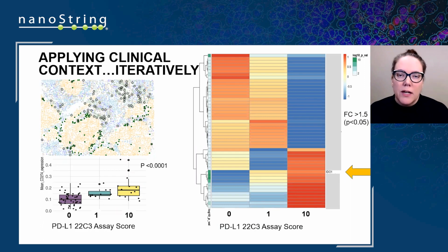We're looking at PD-L1 expressing macrophages by spatial context or niche. We're comparing them to each other to determine whether that spatial location is actually critical clinically or not. We elevate that to the next question, which is, we know PD-L1 can also be expressed in dendritic cells. We know it's expressed in lymphocytes and in a rare subset of breast carcinomas. We explore all of those same relationships in all of those other cell populations from the same data set.